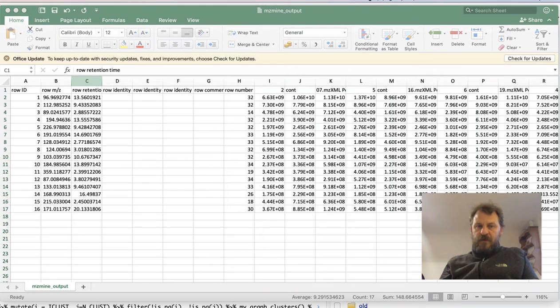The new Shiny converter for untargeted data can use many different formats as input. However, most of them look very similar. For example, MZ-Mine and L-Maven have more or less the same kind of input format. And also, Binner uses a very similar kind of input-output format.